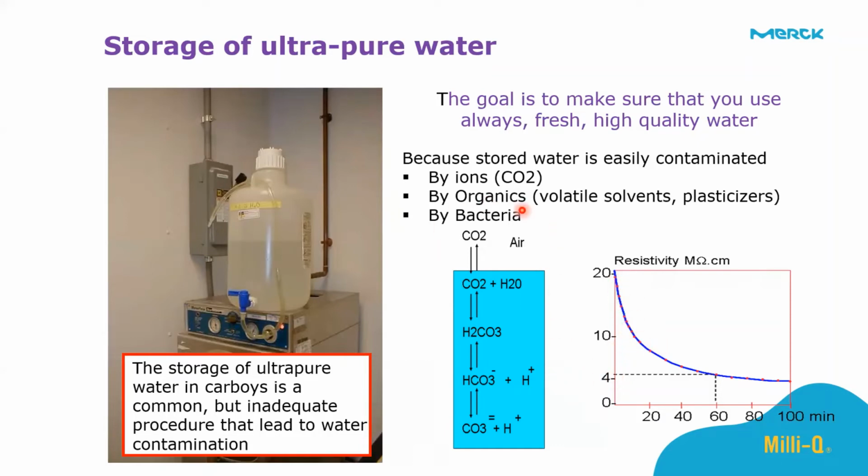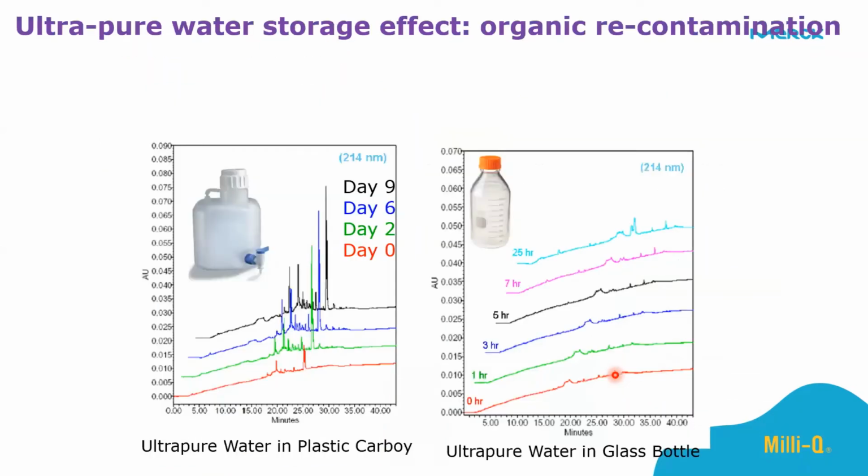And normally what happens, you have carbon dioxide in air that is dissolved in this highly soluble solvent, that is water, type 1 water. So very aggressive, and you'll have carbonic acid, which will, of course, cause the resistivity of this water to go down. So really, just to mention again, type 1 water or ultra pure water should be freshly prepared and used immediately to avoid that. And of course, it also depends on where you store this water.